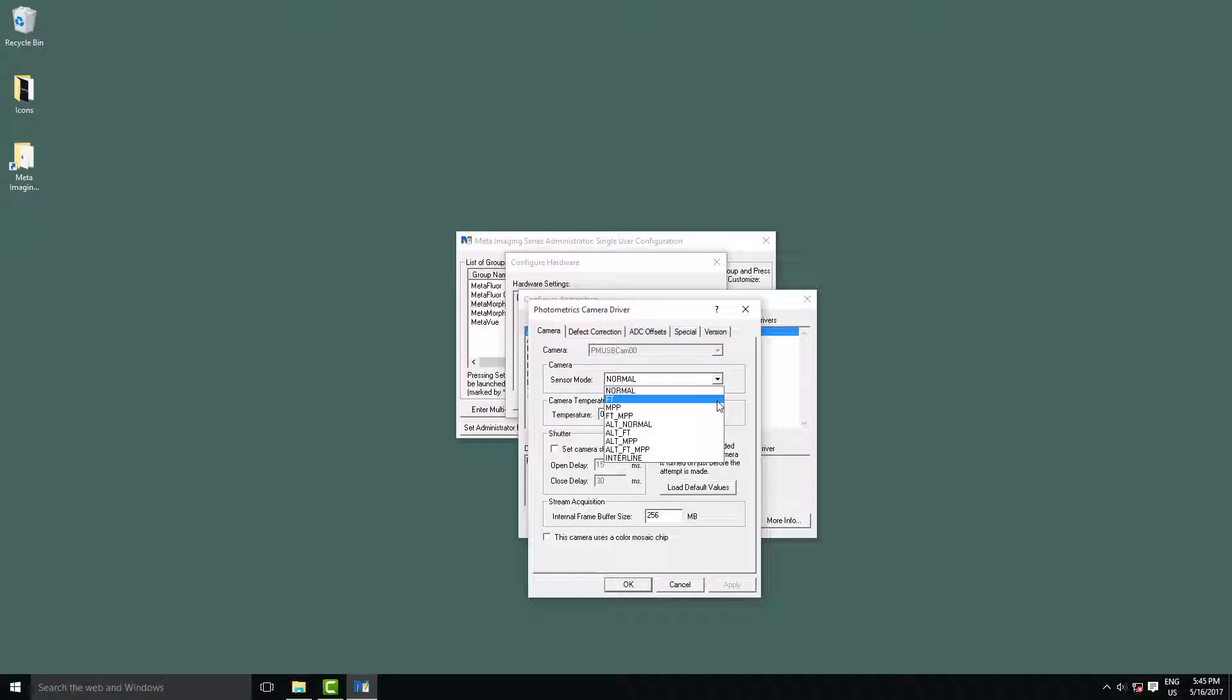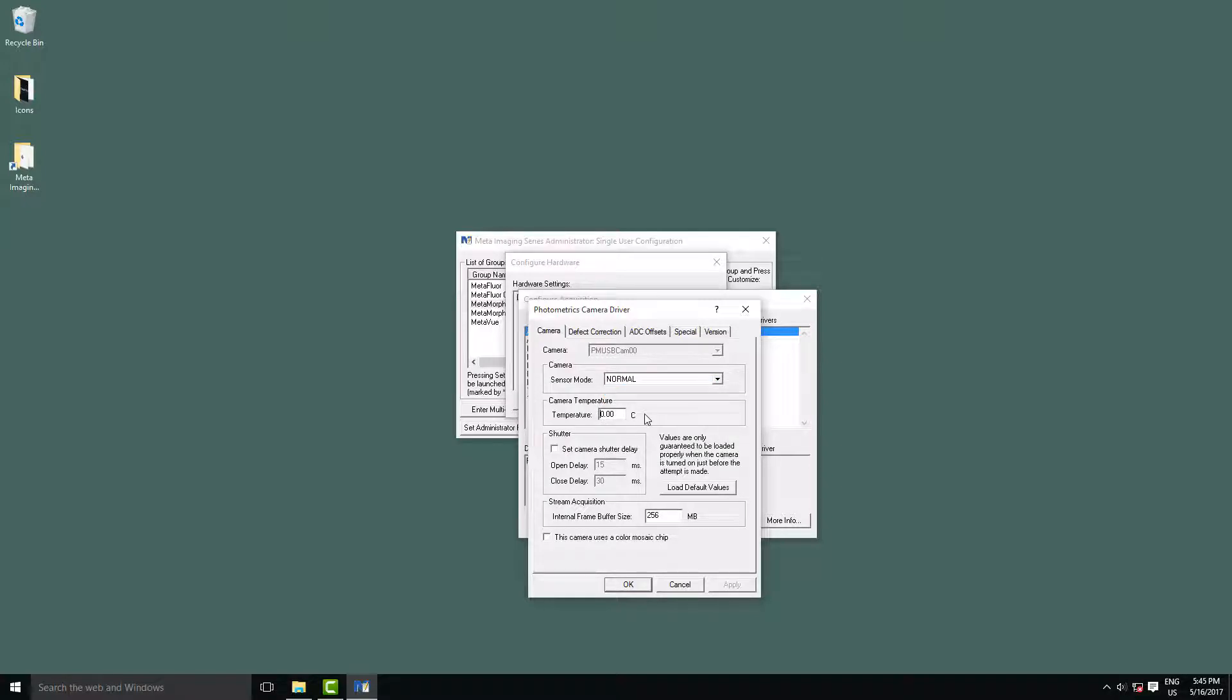The next important setting to change is the temperature. Metamorph doesn't actually know by default what temperature to set the camera to, and for the prime you can read this in the datasheet of the camera, and we want minus 10 degrees.